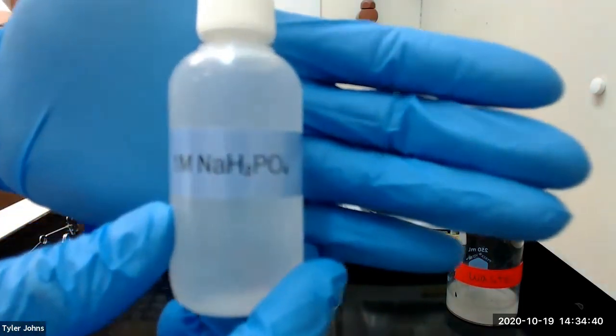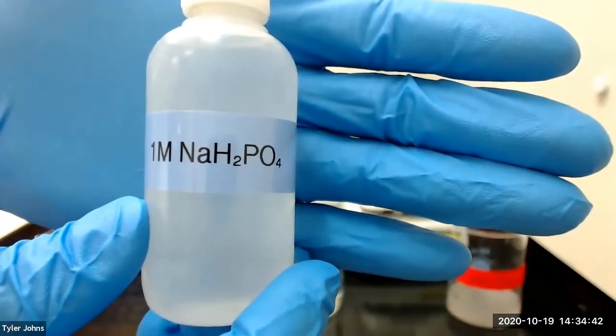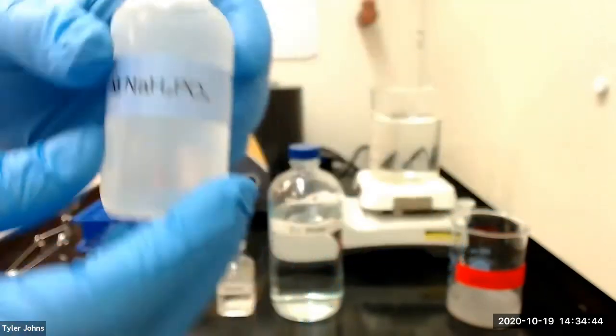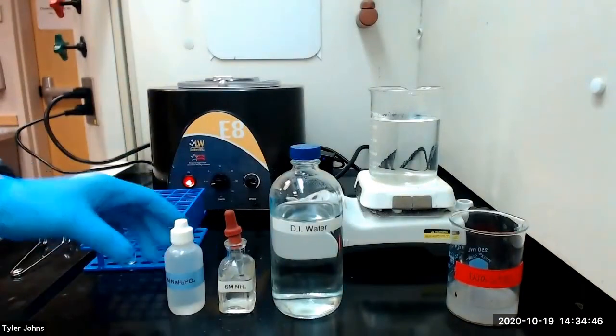Then we will add 0.5 milliliters of 1 molar sodium dihydrogen phosphate, and we will stir for 5 to 10 minutes. A white precipitate of magnesium ammonium phosphate hexahydrate is a preliminary indicator of magnesium.